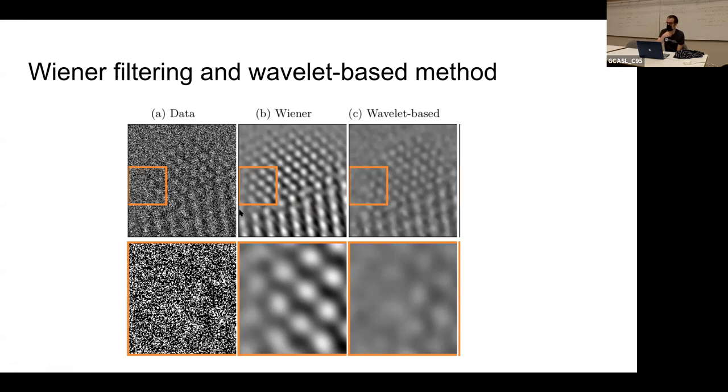Any comments about the Wiener filter? No, that's exactly it. The periodic part overpowers it, so it just keeps repeating the periodic part everywhere. There's so much noise, it only manages to find this strong periodic pattern. The periodic pattern is actually there, but there's also other structure, right? There's this edge structure that it doesn't manage to preserve.